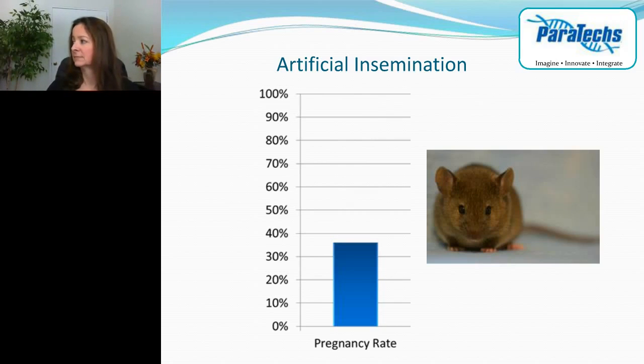Okay, good. How can I best be trained to use the NSET procedure? Training for non-surgical embryo transfer can be minimal if you have a lot of experience with mice, or sometimes if you're uncomfortable with the procedure itself, it's helpful to take a class in this.